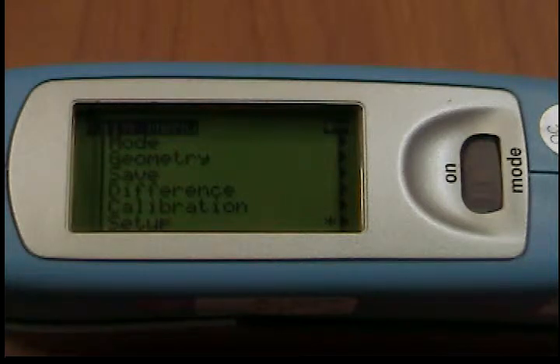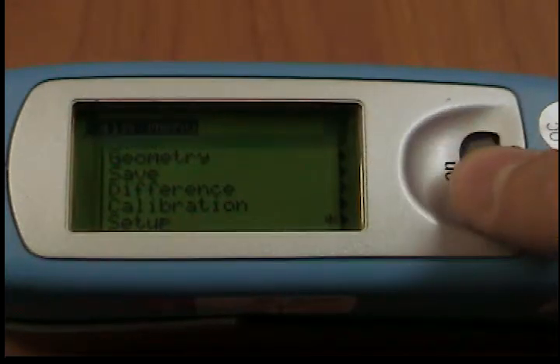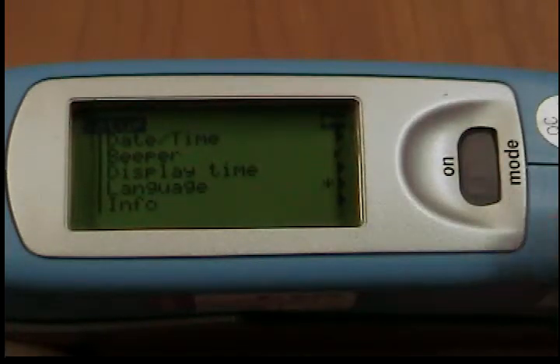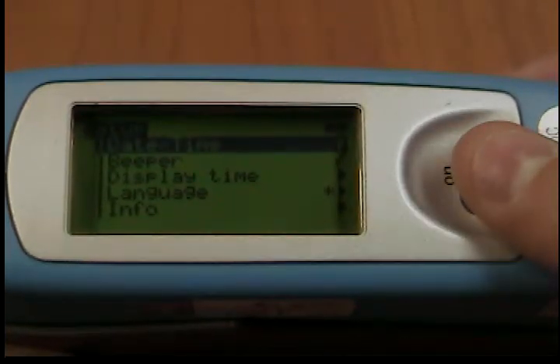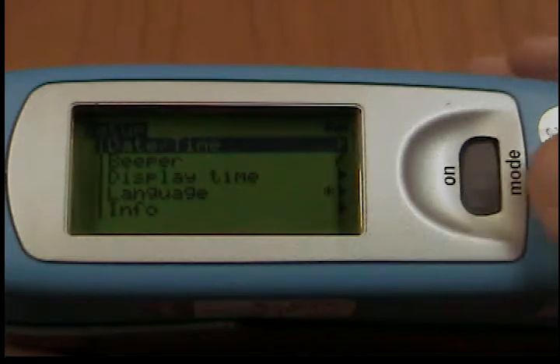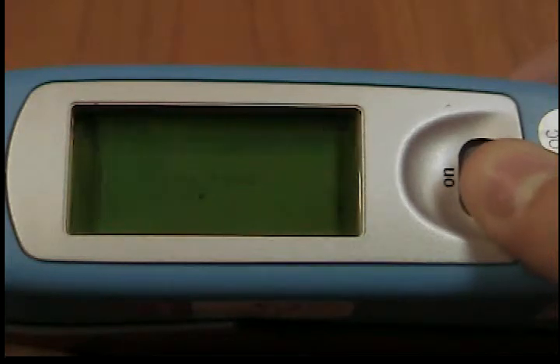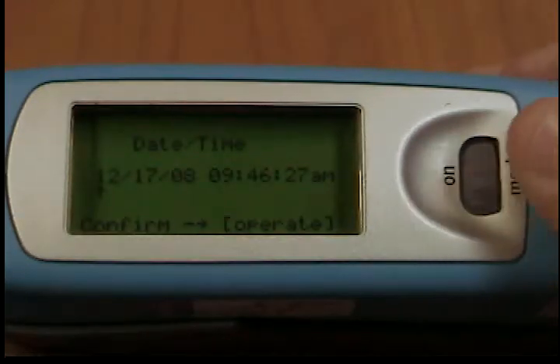Date and time. The unit contains an integrated clock. This makes the date and time of the measurement available for data transfer to a PC. The date and time are not lost even when your battery is changed. If you would like to change the time setting, use the scroll wheel to move the mark to date and time and press mode. The display for setting the date and time appears.